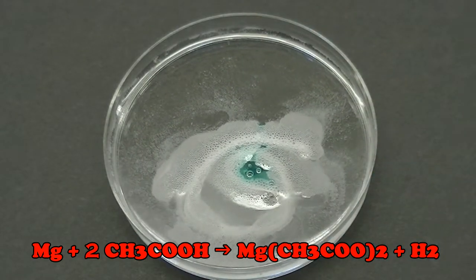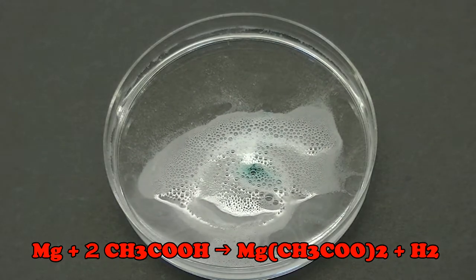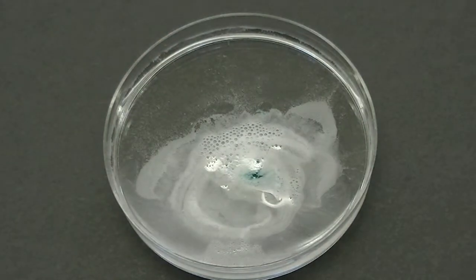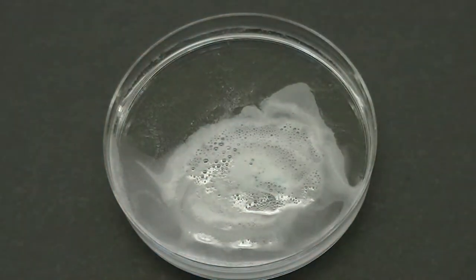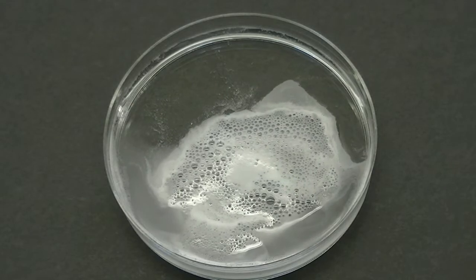If I add a little bit of soap to the mixture, the hydrogen gas that's produced will get trapped inside some soap bubbles, and we can light those soap bubbles on fire. Those tiny pops that you hear are actually tiny explosions.